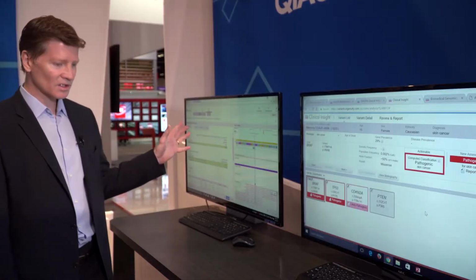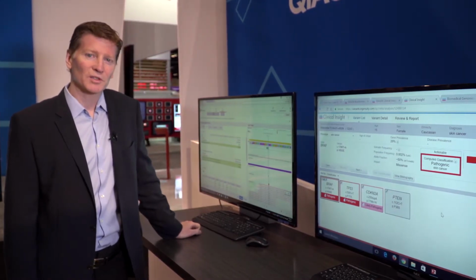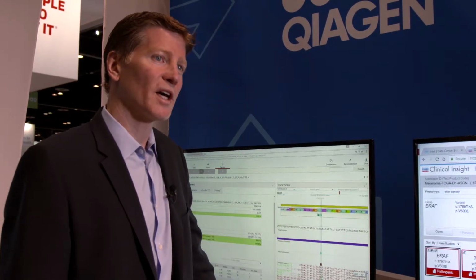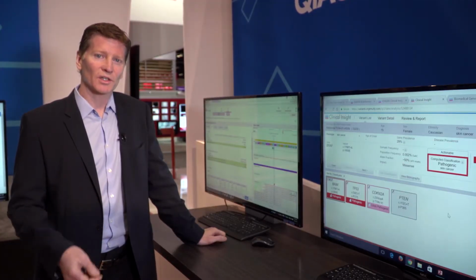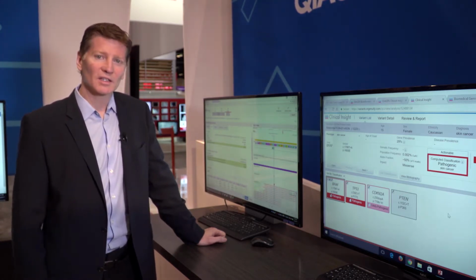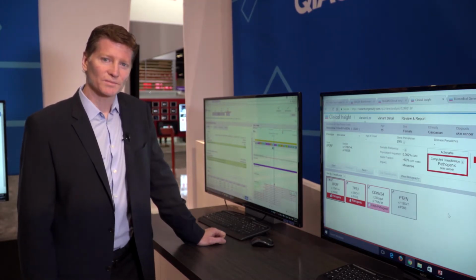So what I'll mention here is that the basic steps are once a DNA or an RNA sample is collected from a particular patient, there's a level of enrichment and preparation that takes place, what we call a wet lab step, and then there's the sequencing, which generates a great amount of data that requires analysis and interpretation. What I'm going to do is highlight for you today the steps from the raw reads off of a sequencing instrument to a report out to an ordering physician.